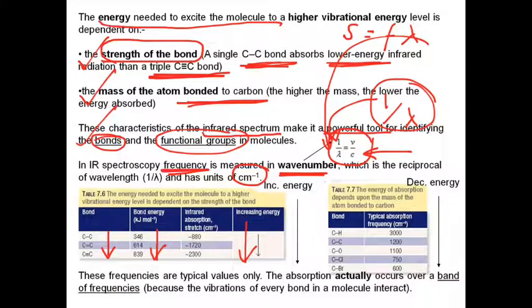Now, what's over here? This is describing a hydrogen there, a carbon hooked up to that left-hand carbon, an oxygen here, a chlorine there, and a bromine there. As we go down that table, those right-hand atoms are getting heavier and heavier, and as they get heavier, you get a decreasing energy absorption. If that's all confusing you, don't worry about it. I think you'll understand it when I talk about the spring analogy on the next screen.